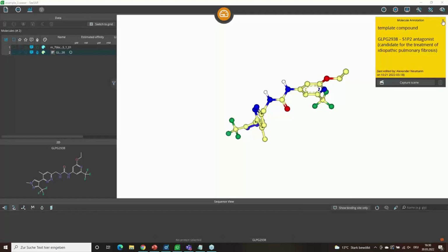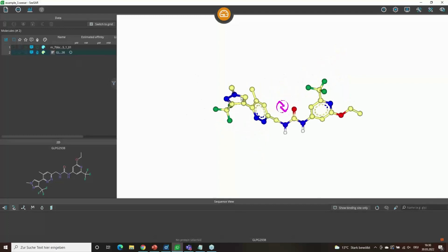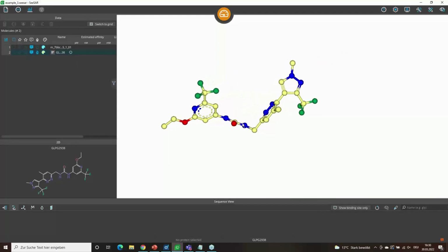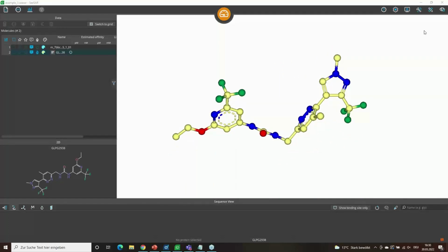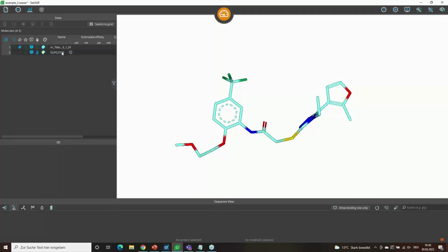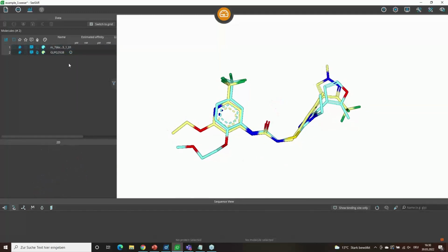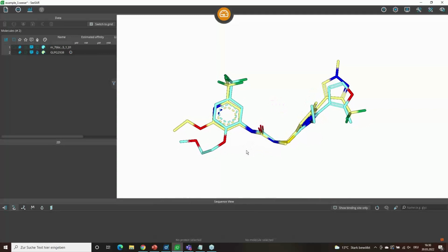And what I did here is just prepare an example of SeeSAR's alignment. In yellow, we have our candidate, our reference compound, and in blue, we have our alignment. So this is the proposition of both. And you ask yourself, well, where's the beauty? Where's the surprise? Where's the fun?